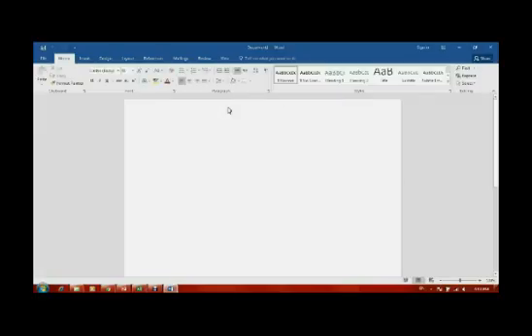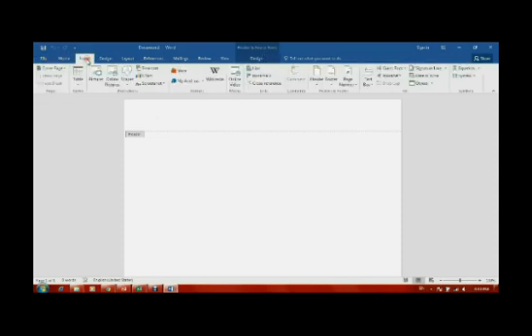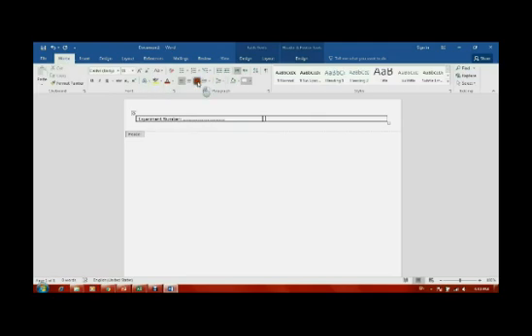Now, build up your portfolio pages. As we said during the practical sessions, you can use a preset template on a Word document, as can be shown. Please prepare this page with the specified layout and keep it to be used for this experiment and all of the upcoming experiments. This may take a couple of minutes to prepare.